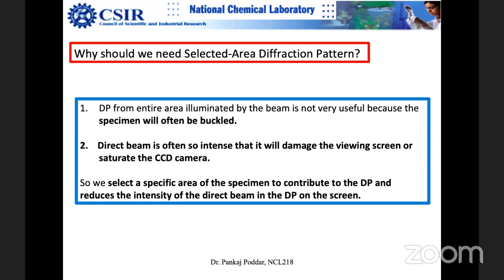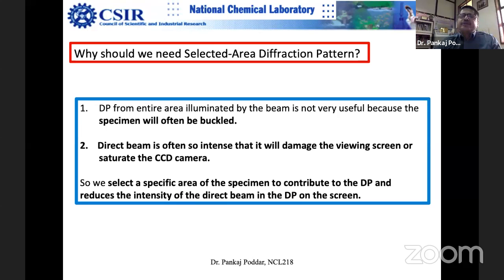Right, this was the mathematical way of doing it. So scientists were very clever. They realized that they did some calculation. They realized, oh, it looks like Fourier transform. So why can't we do it using software? So now you can use the software to do the same thing which lenses are doing.